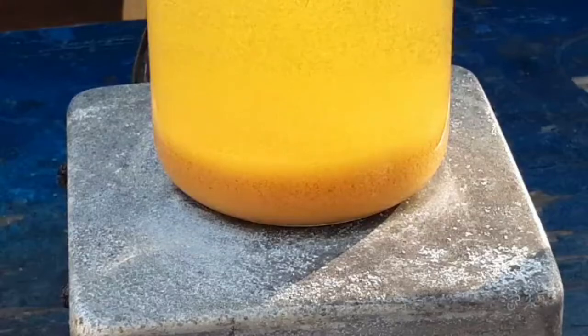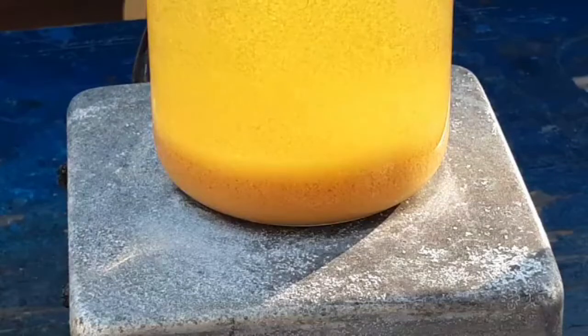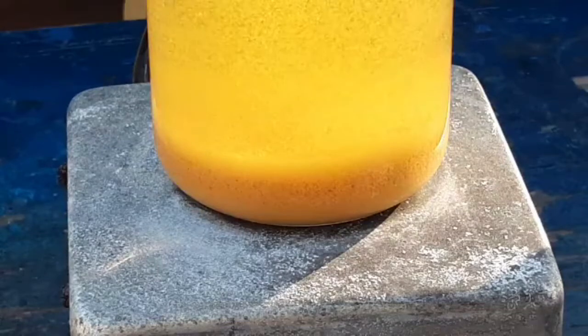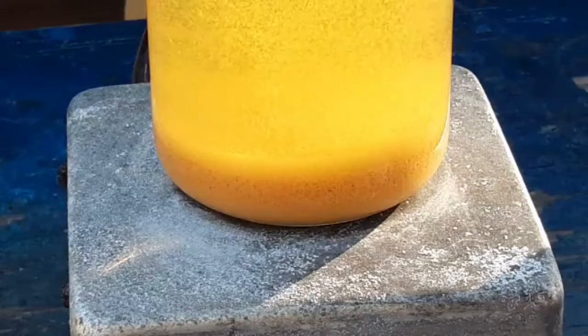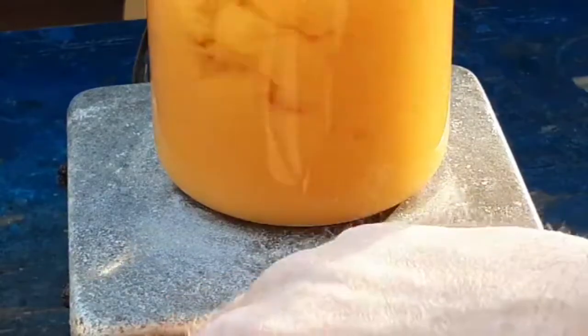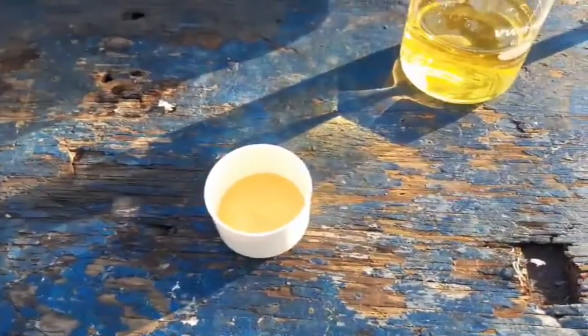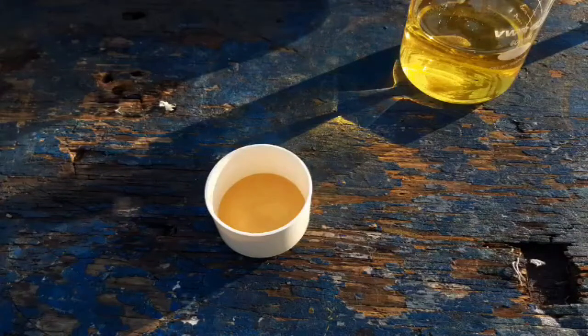Wait — is there something that's a different color settling on top? There's some yellow stuff settling on that, man. Is that what I'm seeing here? I'm going to be really pissed off if you keep on doing this.